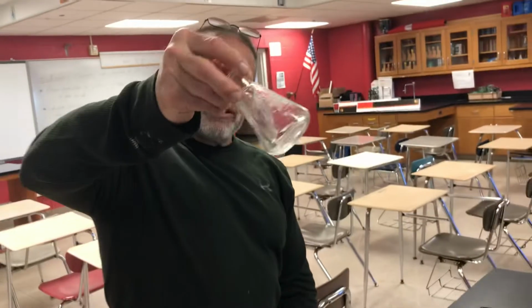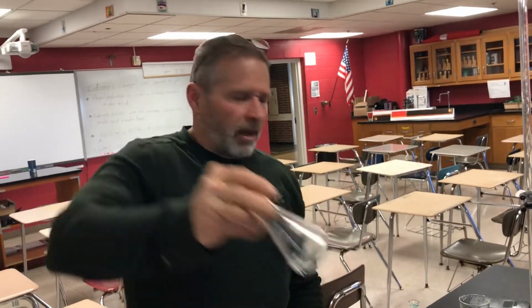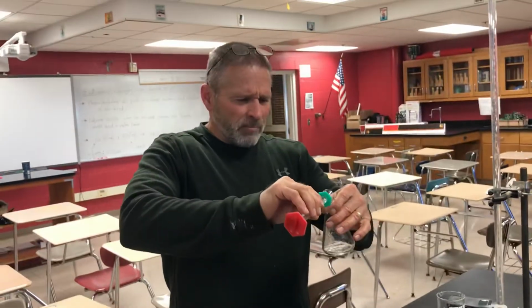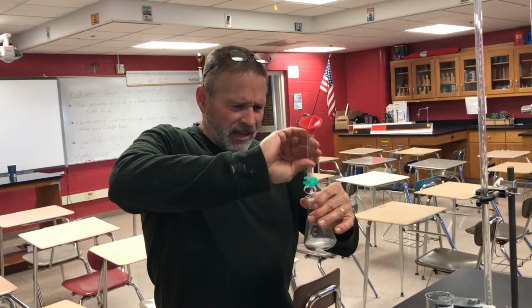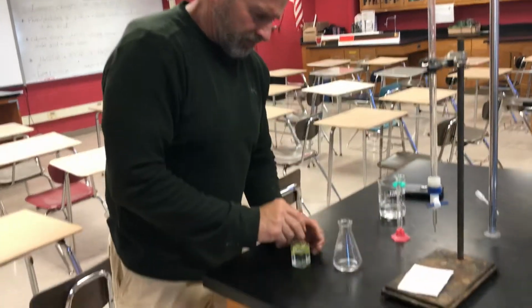Now, I rinsed this flask out, Mr. Moore. There's still some water in here. Yeah, let's just run it. It's not our grades. That's always my thought. I'll just add the acid to that water and we'll see what happens.